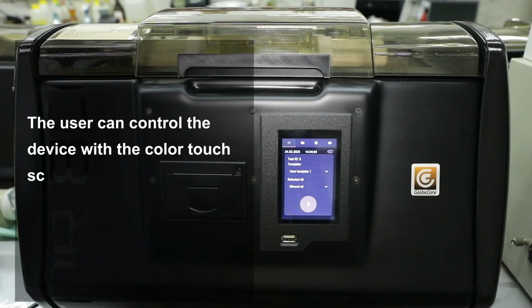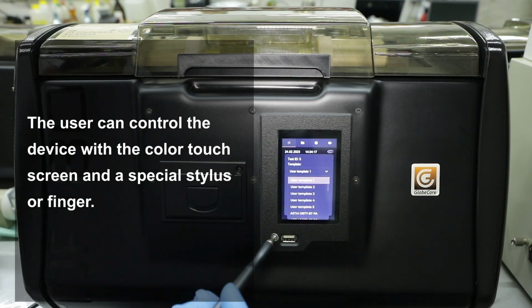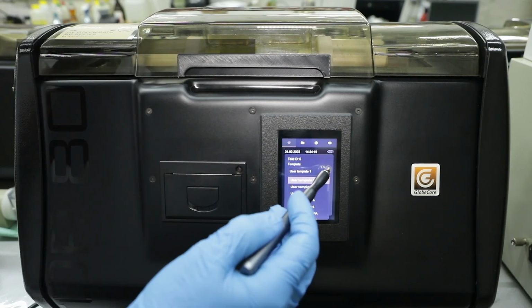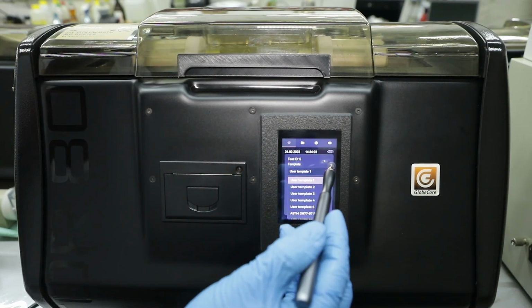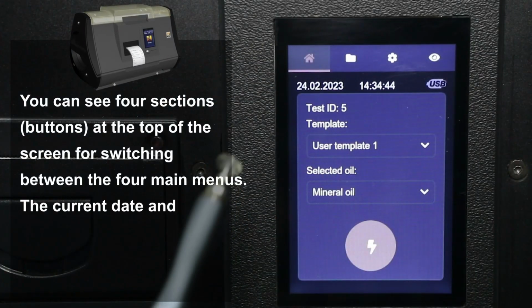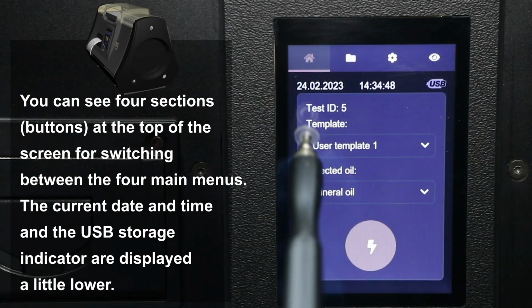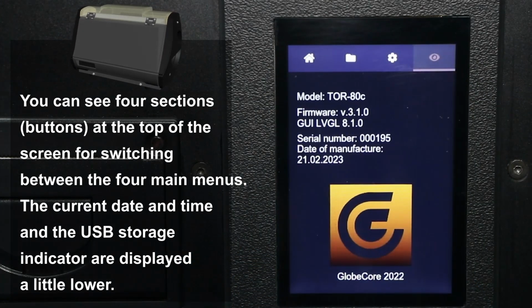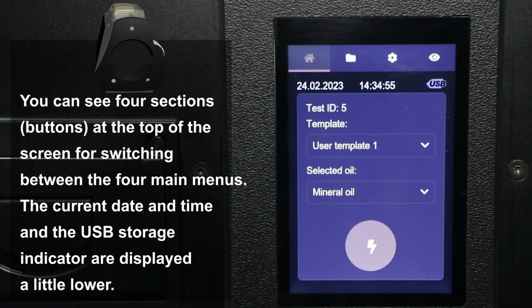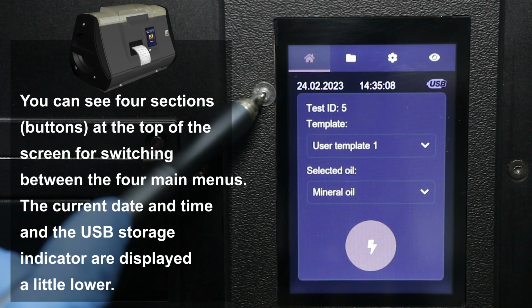The user can control the device with the color touchscreen and a special stylus or finger. You can see 4 section buttons at the top of the screen for switching between the 4 main menus. The current date and time and the USB storage indicator are displayed a little lower.